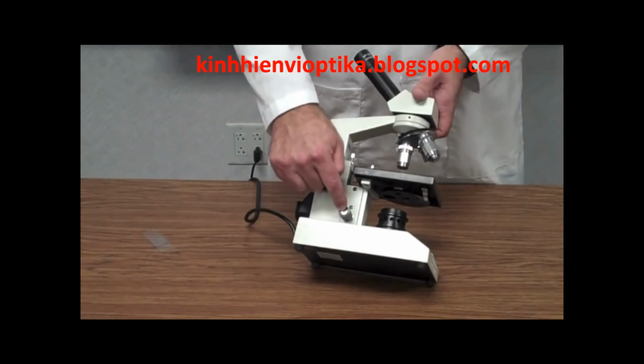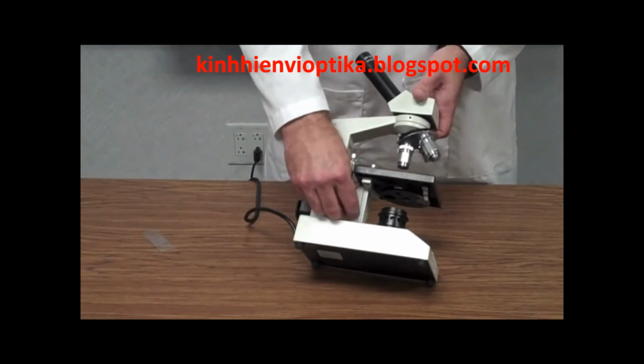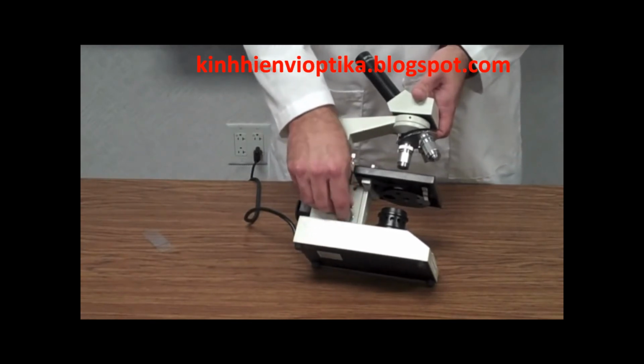Here is the fine adjustment knob. The fine adjustment knob is used for that real sharp focusing to get your image real clear.